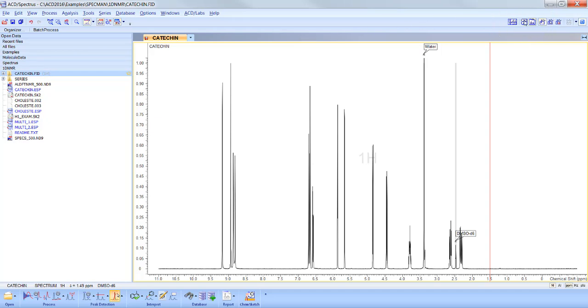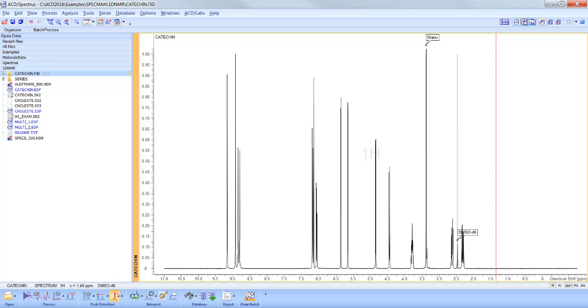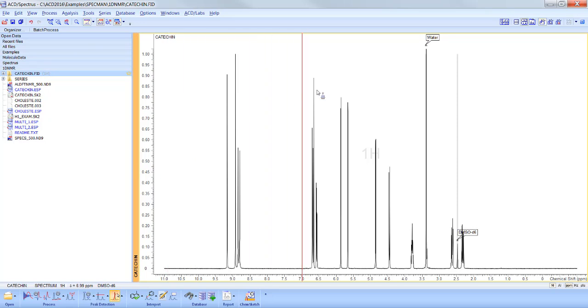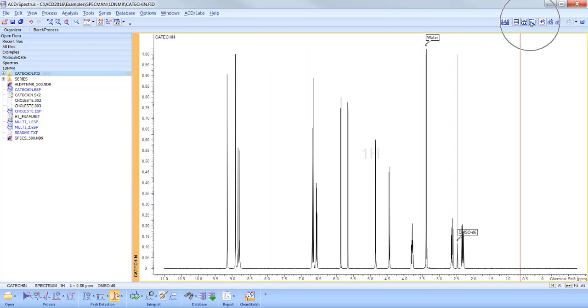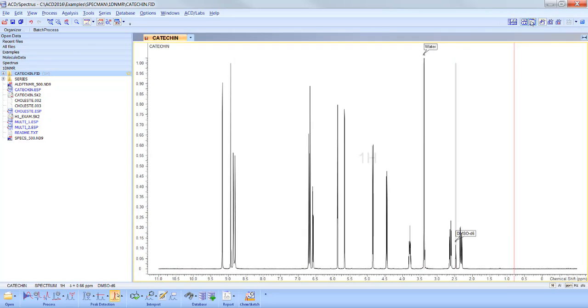Multiple spectra can be displayed in either tab or tile mode. The current layout can be saved and managed accordingly.